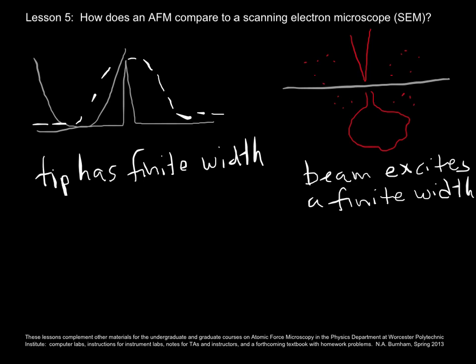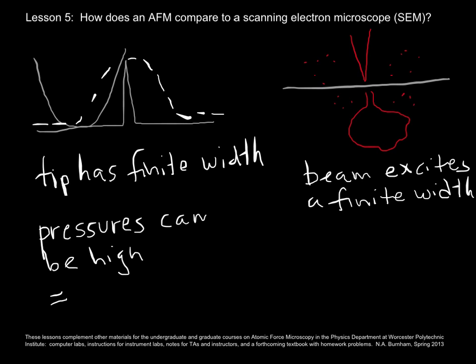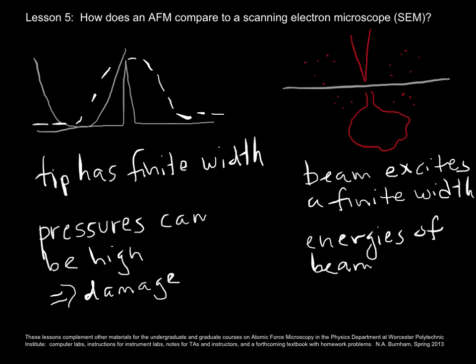And in AFM, you know that the pressures can be high. We made that point in lesson 1. And that can cause damage. In SEM, the energies of the beam can be high, right?